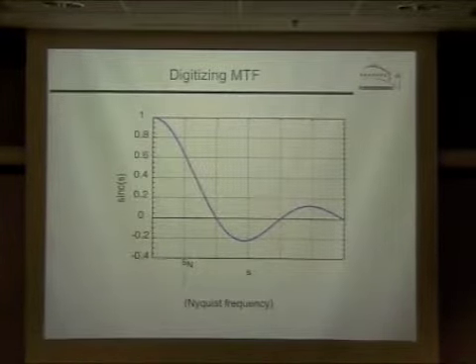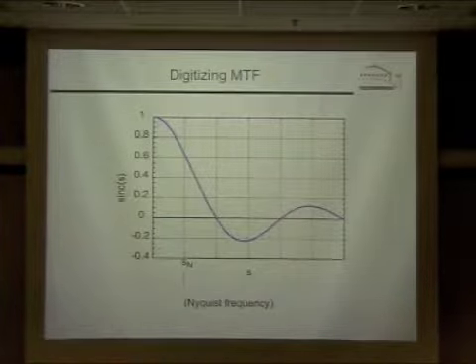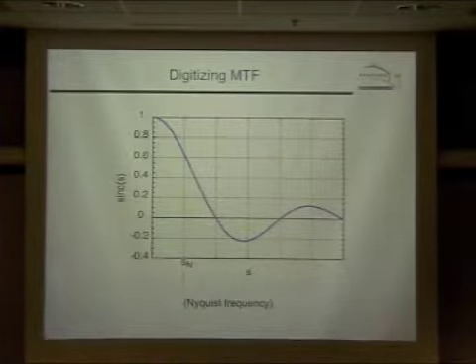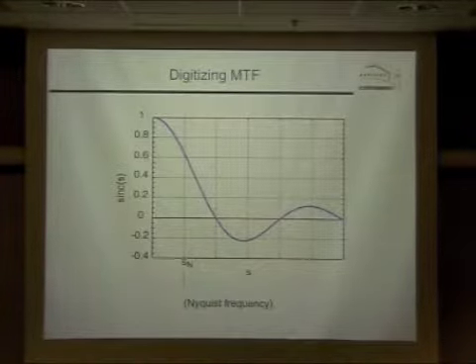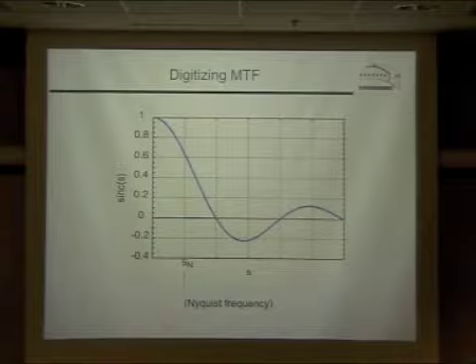Looking at the film microscope, that happened in Basel. They had a very high resolution crystal and were scanning with a pixel sampling level that was too large. And so the Fourier transformation showed the diffraction pattern out to the edge, and it was bouncing back into the image.